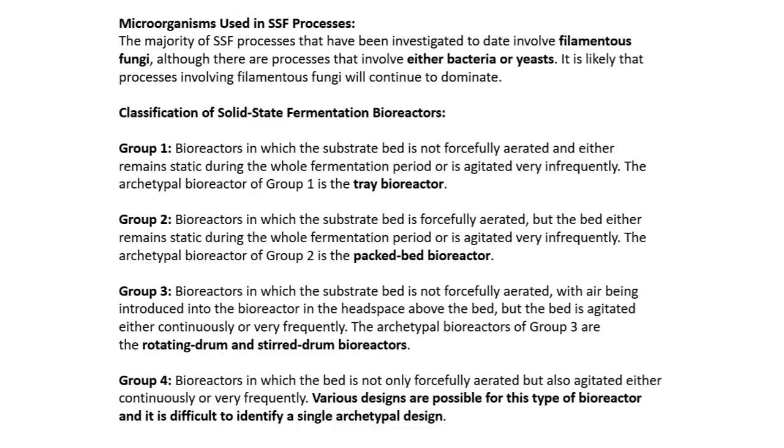So, the difference between group 3 and group 4. In group 3, the substrate bed is not forcefully aerated. Both are the same. The air is being introduced into the bioreactor in the head space above the bed, but the bed is agitated, either continuously or very frequently. The only minute difference is that the air is passed only to the head space.